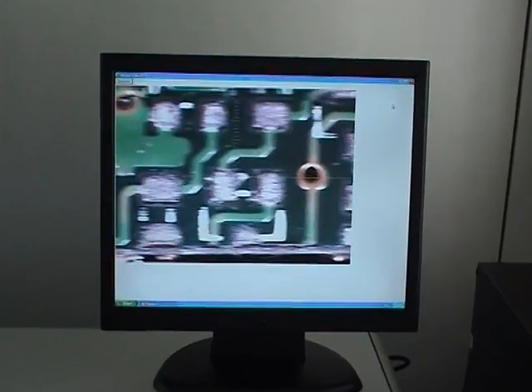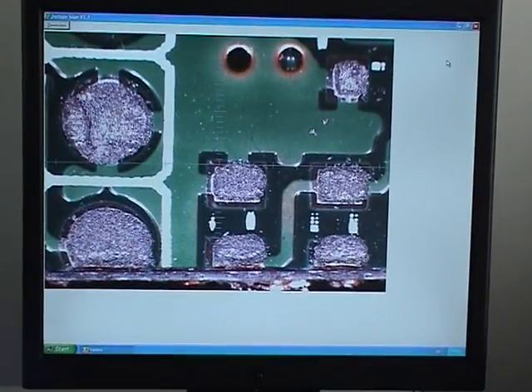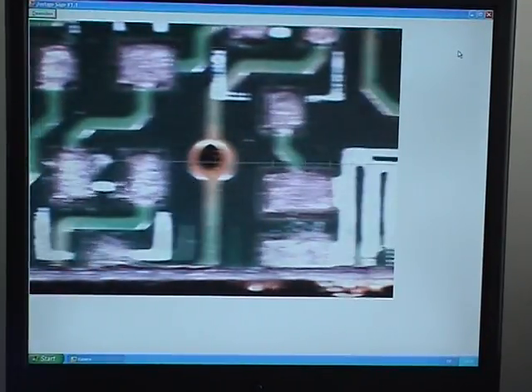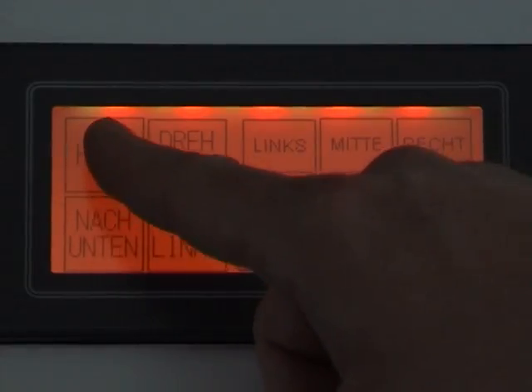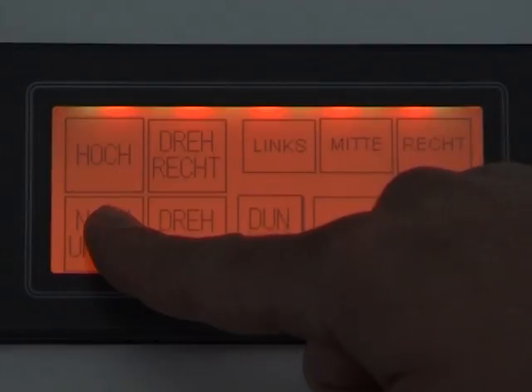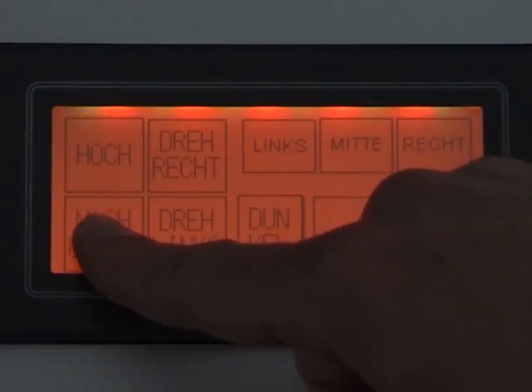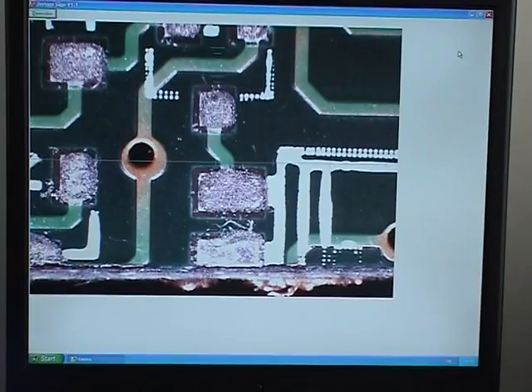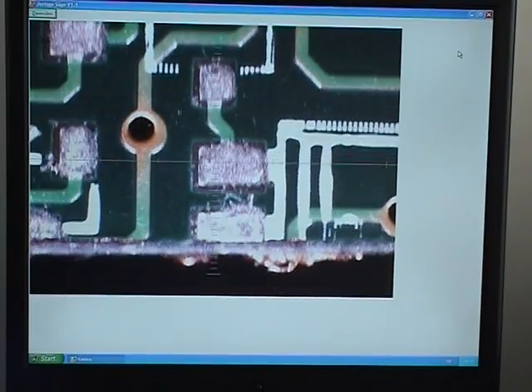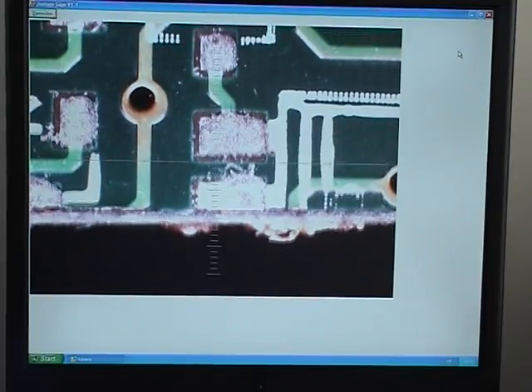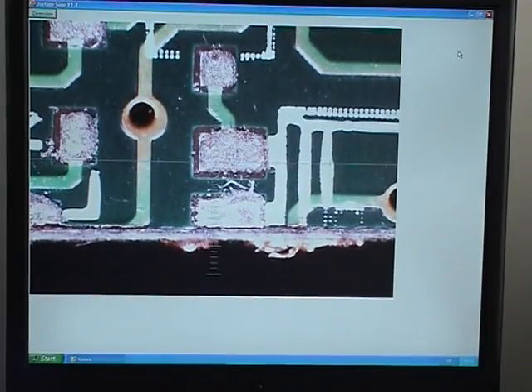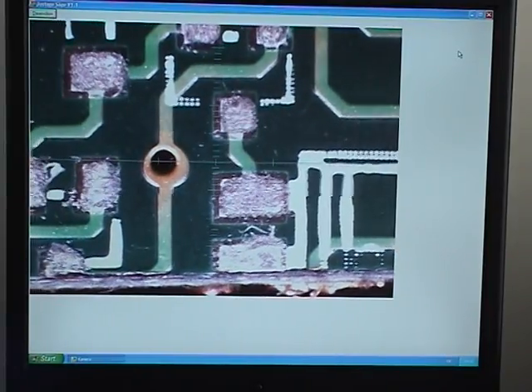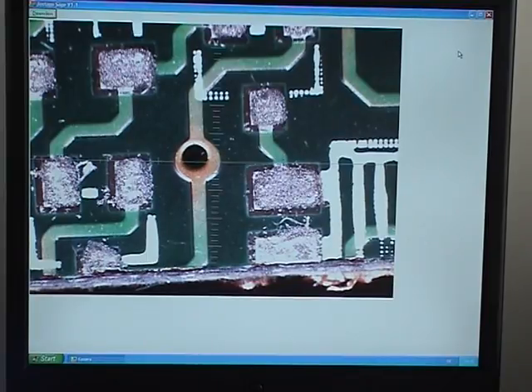By that you are able to position a single hole or several holes in a row precisely to the cross wire on the screen. The specimen can be moved horizontally and vertically. Also a slight rotation is possible in clockwise and counter-clockwise direction.